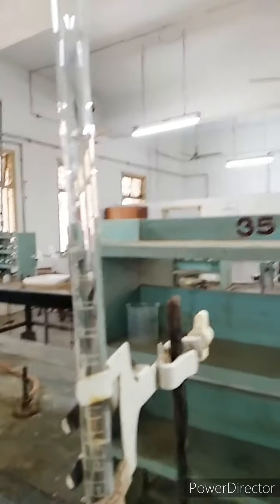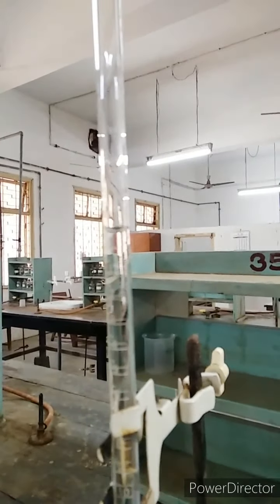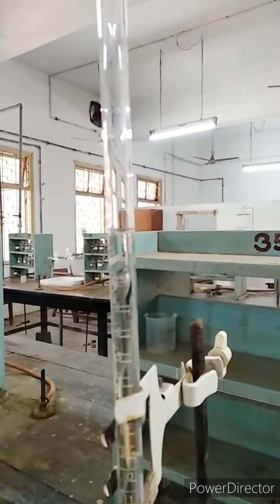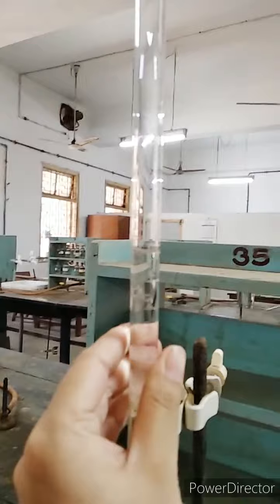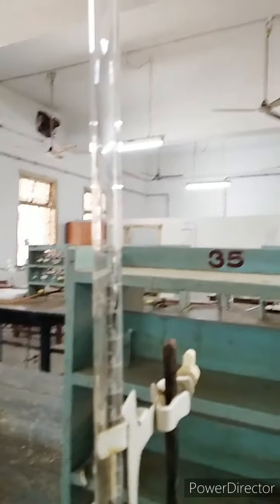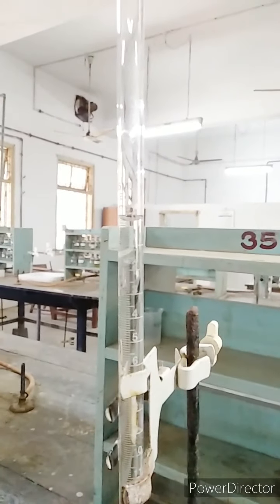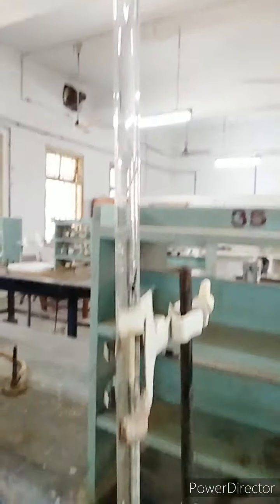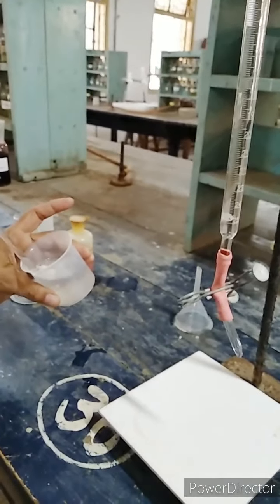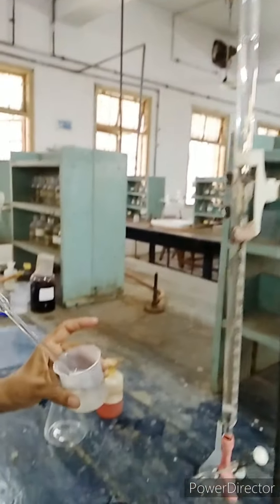And note that the lower meniscus of the solution is at the 0 level, since we have learnt that for a colorless solution we have to note the 0 level at the lower meniscus of the solution. We will take 10 ml Na2CO3 solution through the pipette into a conical flask.